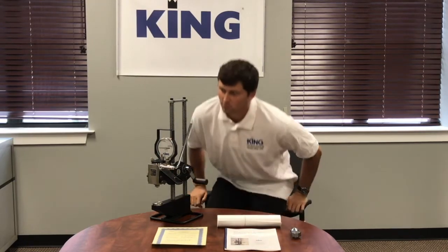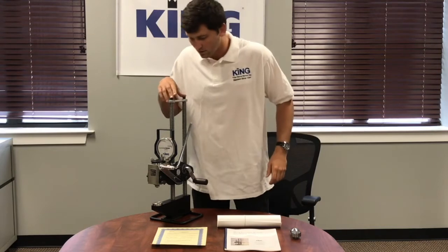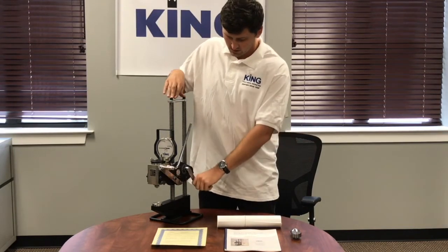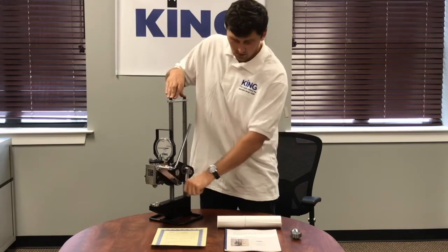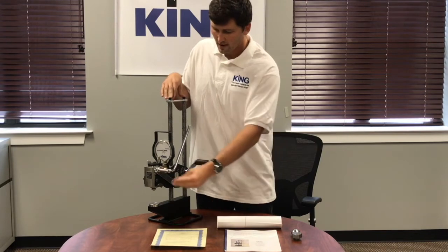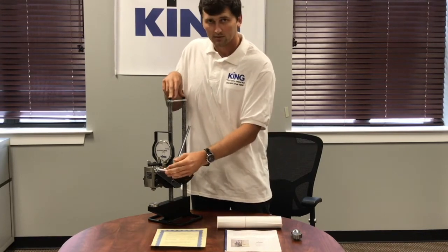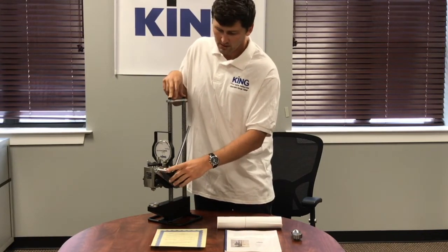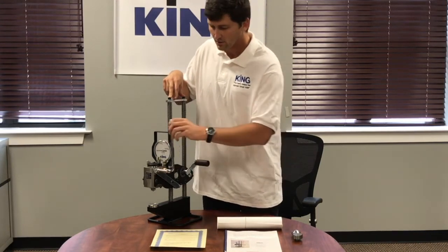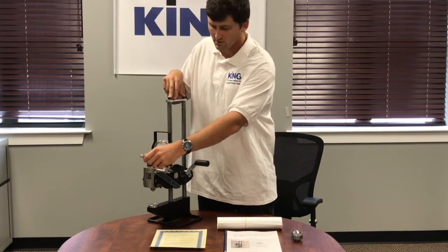Moving on to the major components of the King Portable Brinell Tester — for the base, this is our crank handle. You're going to pump it up and down when you go down and set it to a piece. We also have our stroke limiter, which is only on our four inch throat bases. This is going to limit wear on your pump segment, limiting that space when you're pumping.